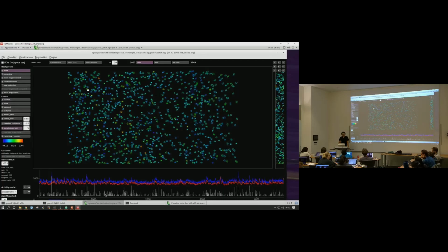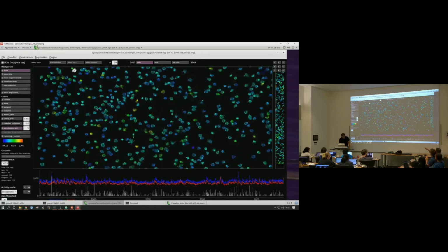Any questions about spike deconvolution in general? I mean, we'll go through the details of exactly how it works, but I just told you what it's trying to do, basically. I have a question. My understanding from the Chen 2013 paper was that if you have, like here, a super big calcium transient, that would count as one spike, but it's probably a burst. And I'm just confused by how you are supposed to think about a giant transient versus huge transients.